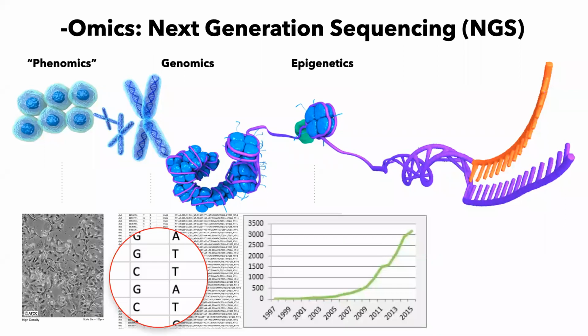Epigenetic regulation of gene expression has been of an increasing interest for the past several decades, and today we can study this kind of epigenetic regulation by analyzing chromatin immunoprecipitation data, as well as bisulfite sequencing data and the expression of micro and long non-coding RNAs.